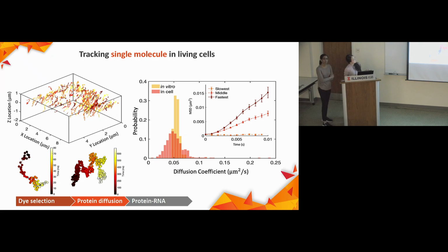If it goes up, then it's superdiffusion. If it's linear, then it's normal diffusion. If it's leveling off, then it's subdiffusion. With the linear one, the slope is not changing over time with a different time lag, but the super and the sub are going to change.